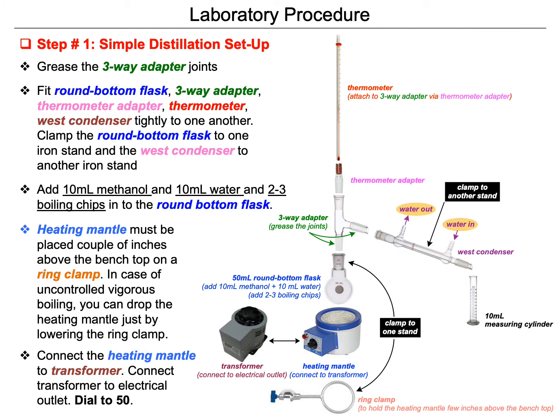So if we look at the laboratory procedure, you see that it's very simple for simple distillation.